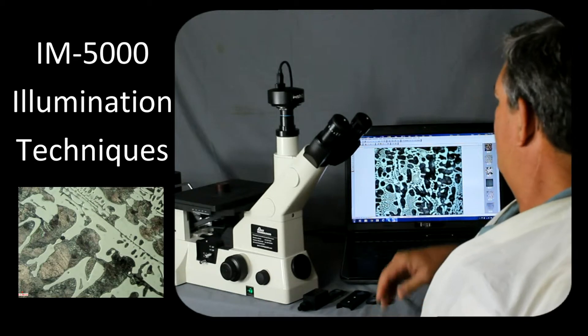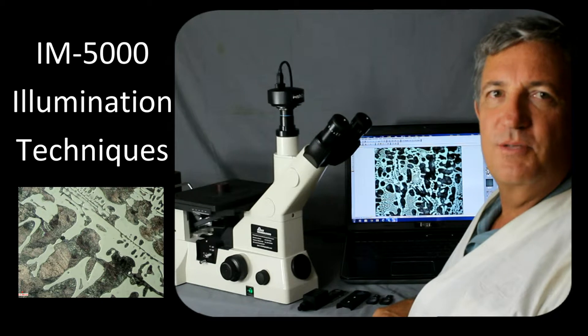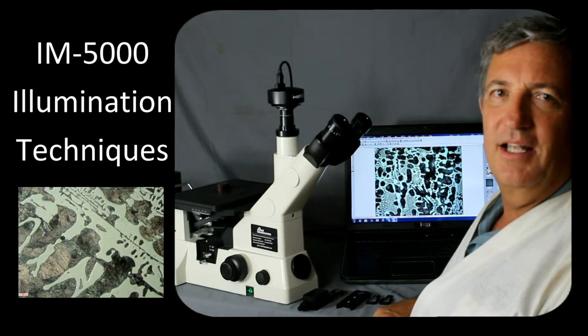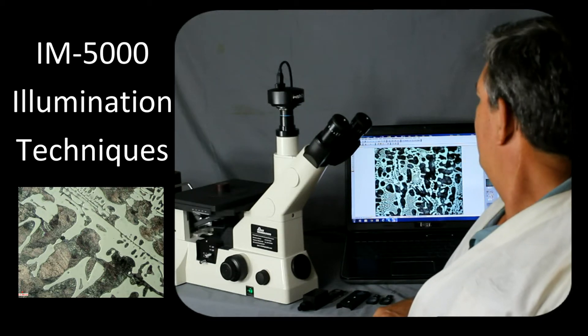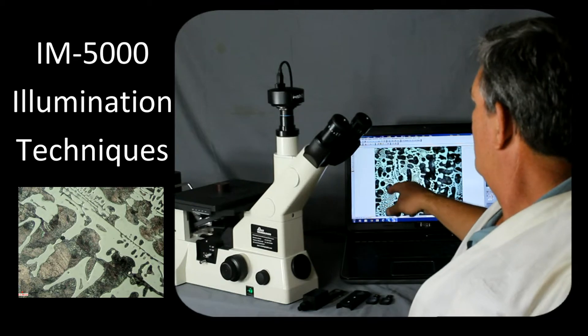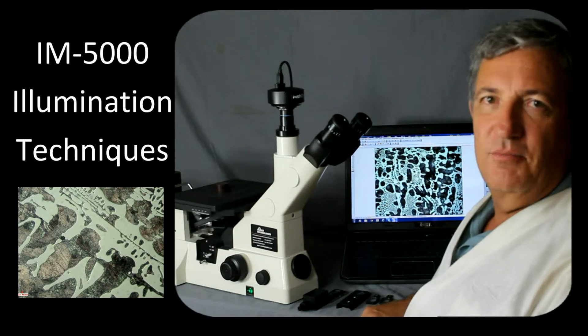The image that's shown on this screen here is bright field illumination, which is the most common illumination technique in metallography. The background will be light and the features will be dark in bright field illumination.